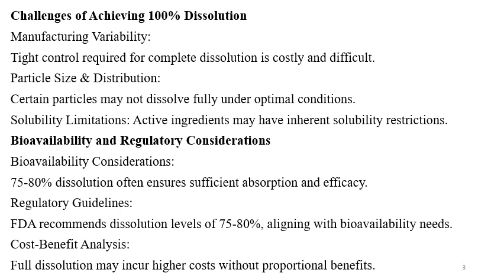Then solubility limitations are there. Active ingredients may have inherent solubility restrictions. Some APIs may float in the bowl. Some may get a little bit degraded. Sometimes the APIs may show solubility problems in the media, and that's why 100% dissolution will not always be possible or feasible.